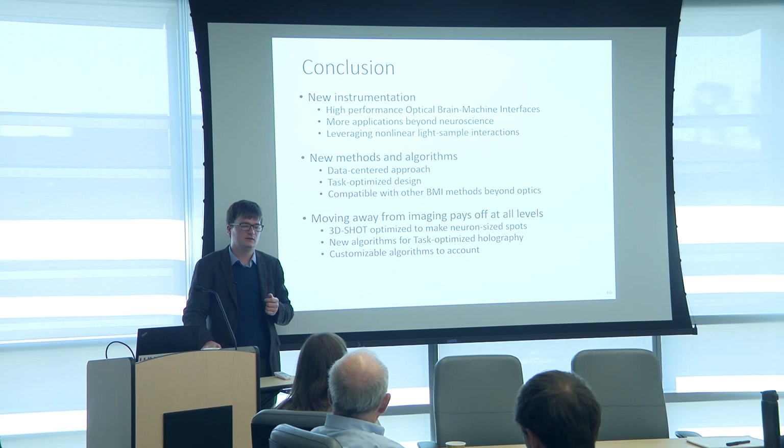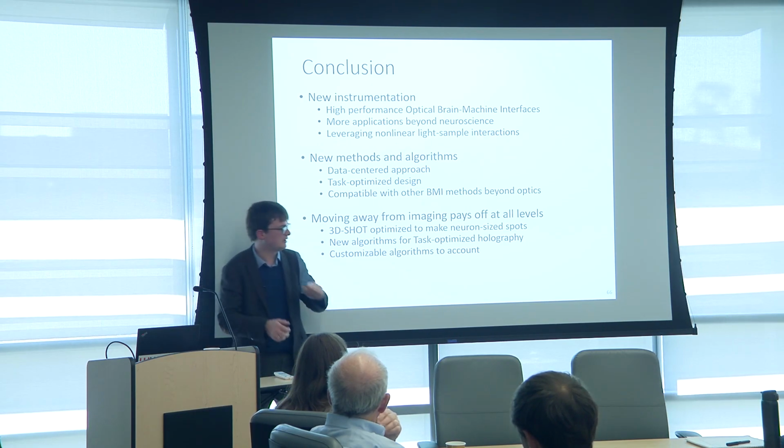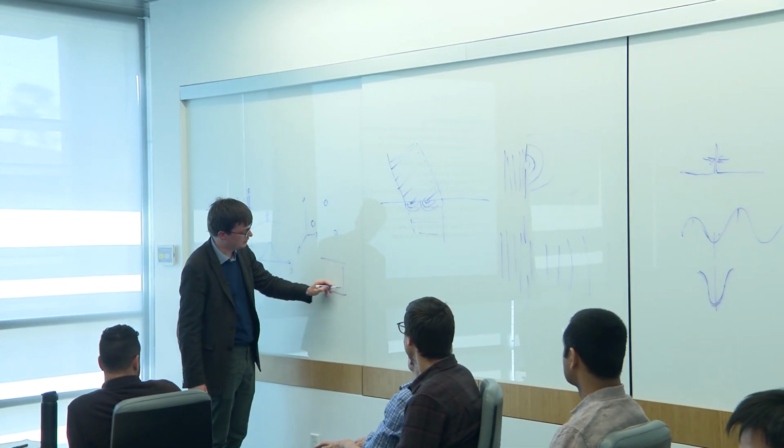I'm sorry, the name is a genius faculty in Switzerland, or sorry, in Austria maybe, somewhere in Europe, that developed the Overdrive technique for SLMs. The idea is that when you want to set your nematic crystal to a certain phase pattern, so let's see. You have an SLM that's basically a pair of electrodes where you apply voltage and in between a liquid crystal.